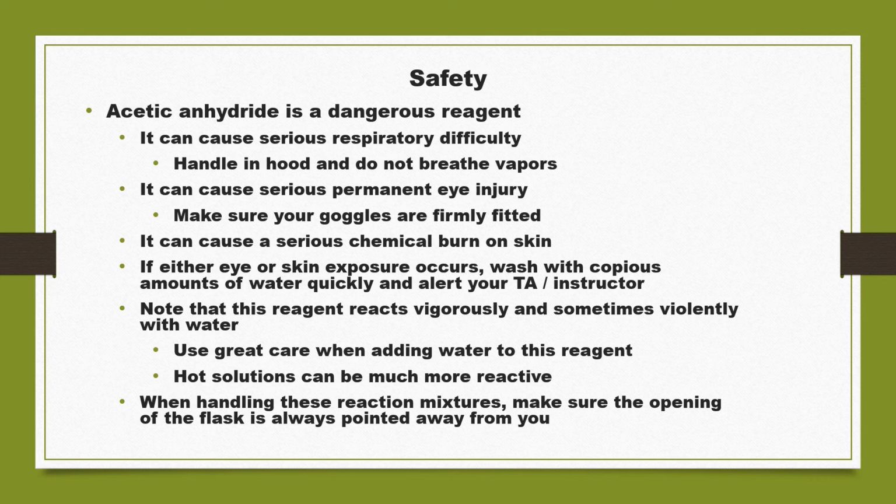Anyway, you do remember that we have used phosphoric acid and acetic anhydride in this lab. Especially the acetic anhydride is known to cause respiratory disorder. Even it can result in permanent eye injury if the vapors itself come in contact with your eyes or you breathe them.